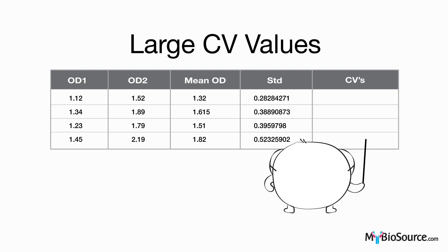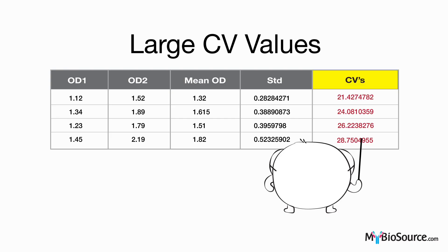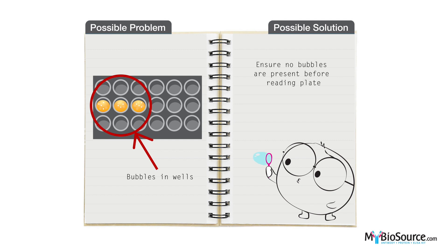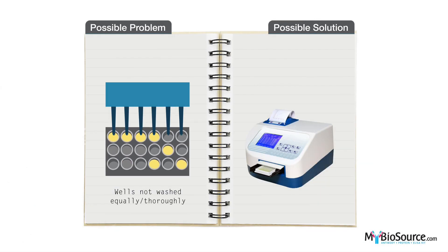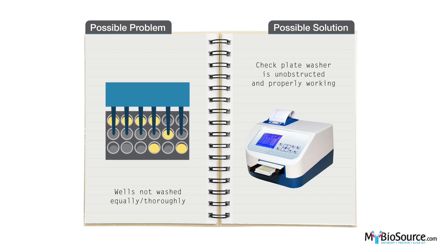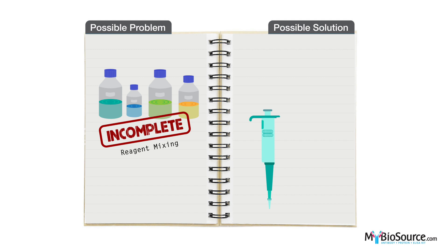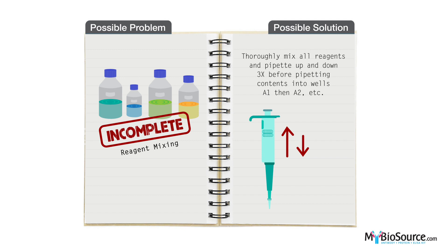Large CV values, generally considered to be above 20% for our assays, may be due to the following: acquiring bubbles in the wells during the assay. Please ensure no bubbles are present in the wells before reading your plate. Also, wells that are not evenly washed may lead to high variation between wells. If using a plate washer, please check to confirm it is working properly and that pipette tips are not obstructed.